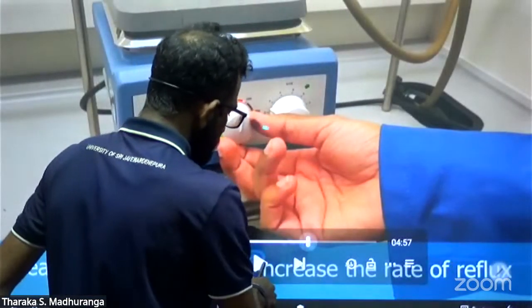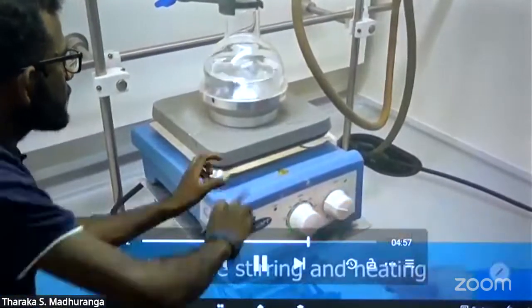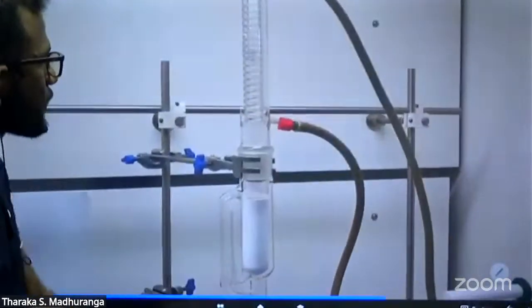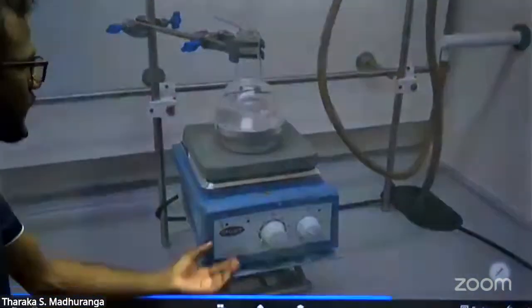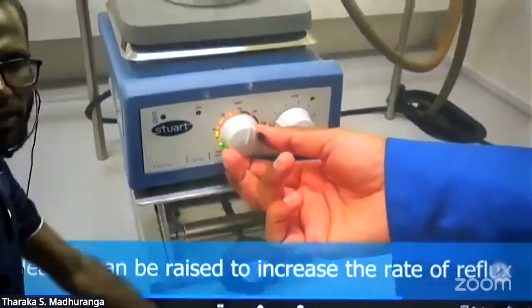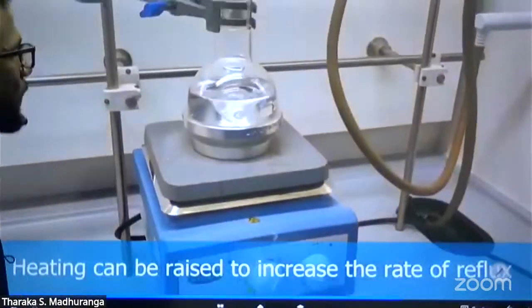Then we switch on the heater. Then you can see it is rapidly heating. That's according to our requirement, we can adjust the temperature.